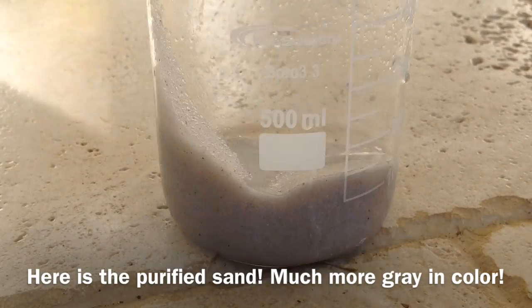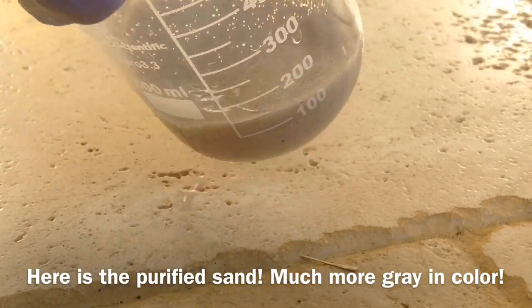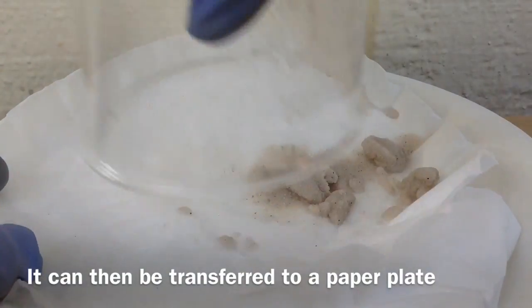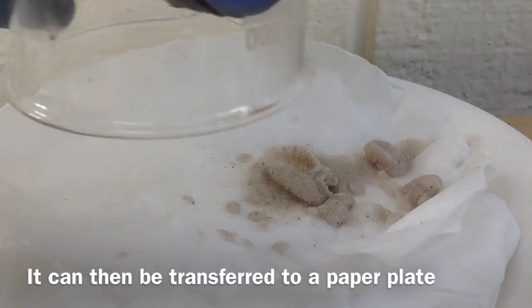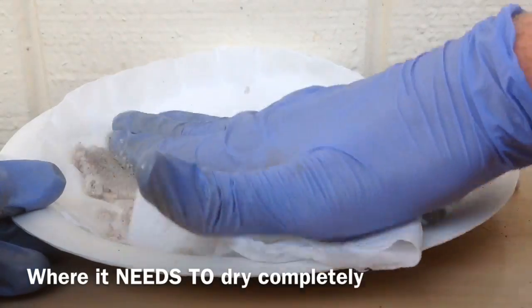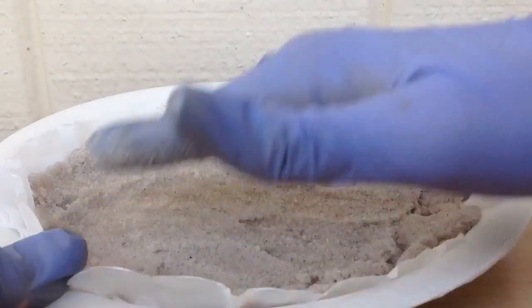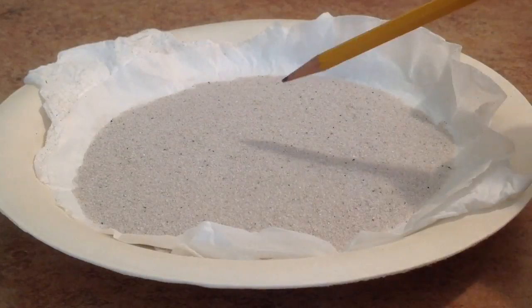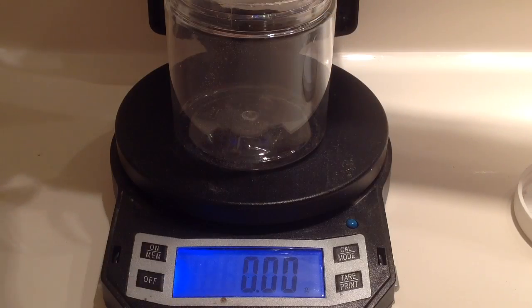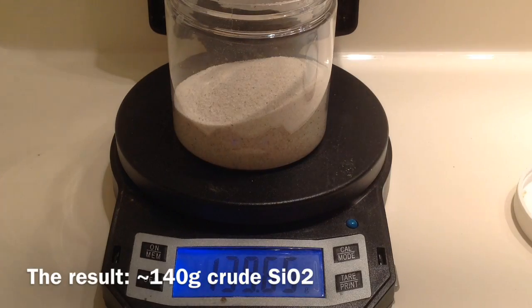Here's the intermediate product: crude silicon dioxide with some black dots in it. We transfer this to a paper plate and dry it, because the next step involves reacting it with sodium hydroxide. Our yield is about 140 grams of crude silicon dioxide.